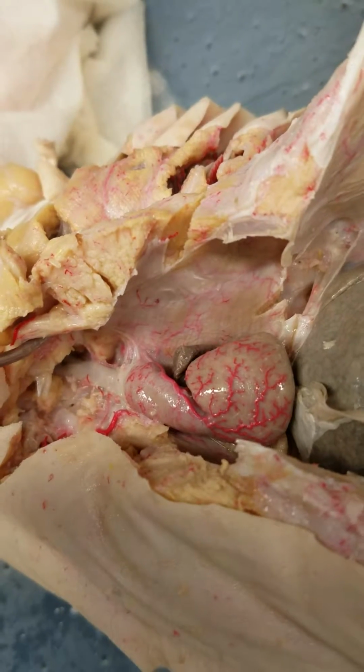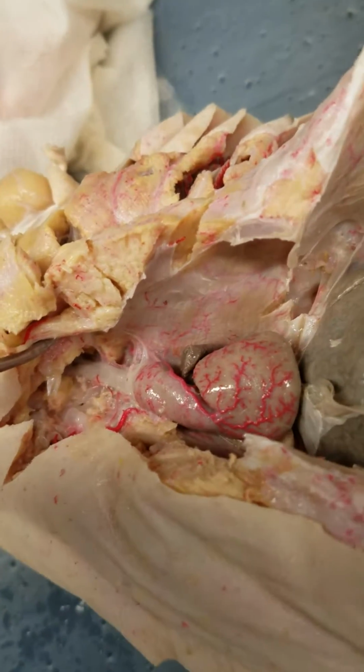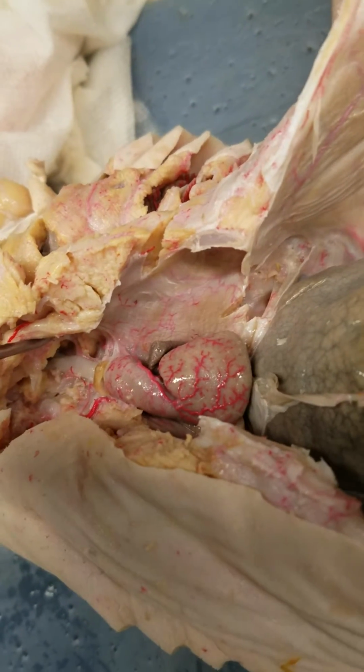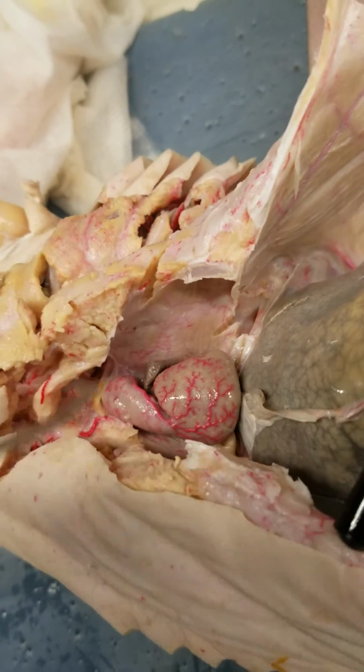So going back up there, it kind of branches off, but we didn't cut up far enough. But that's also where your afferent branchial artery is going to be as well.